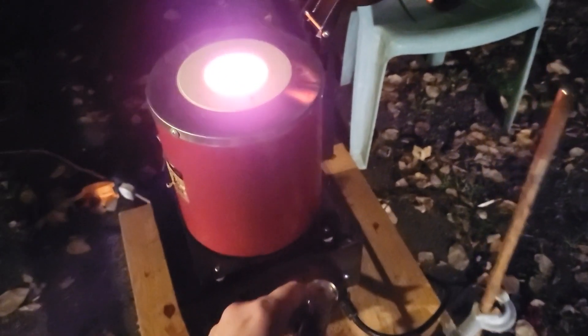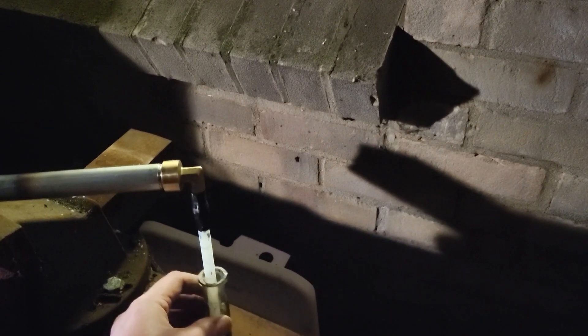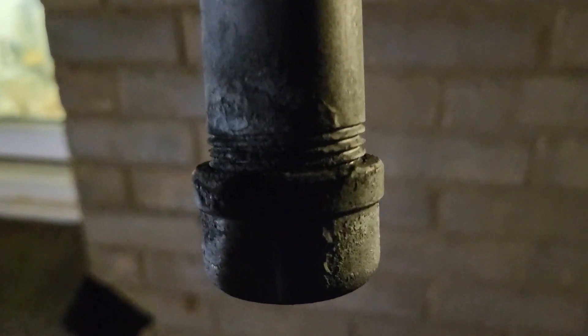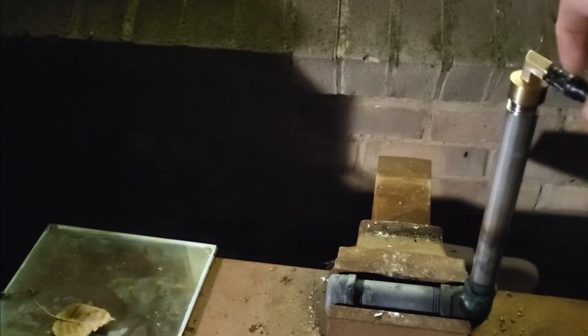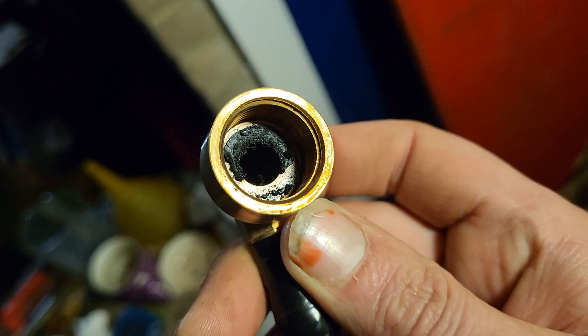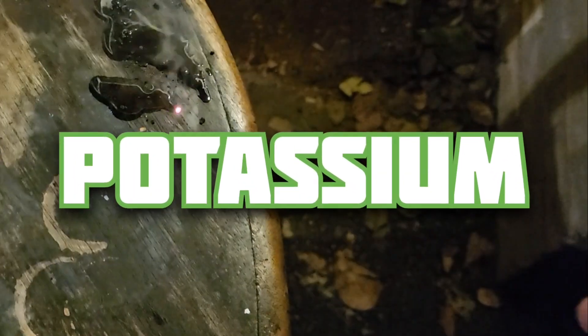There's certainly something in there. There we go — you can see there's a dark solid in there. And that looks like potassium on the tube. What is that? That is potassium!